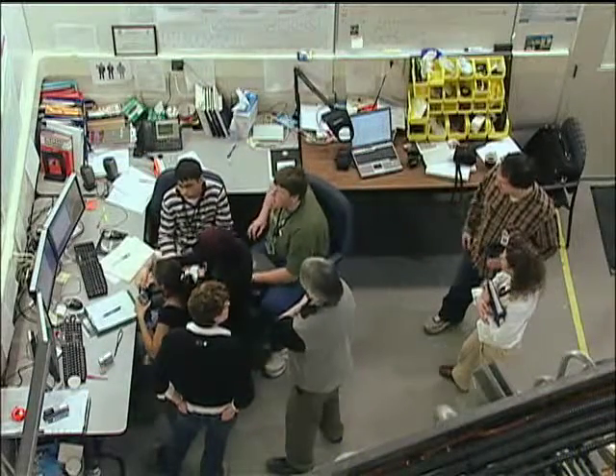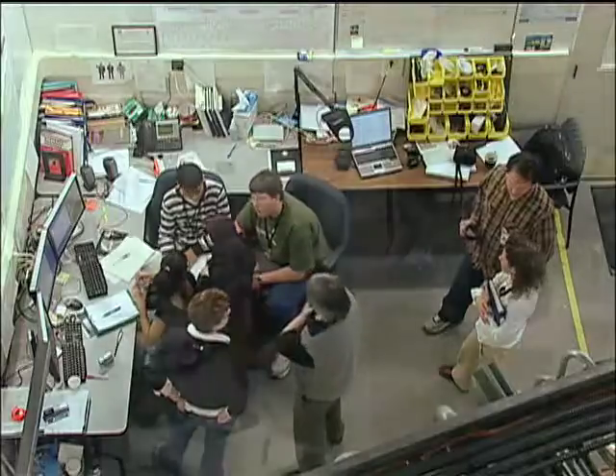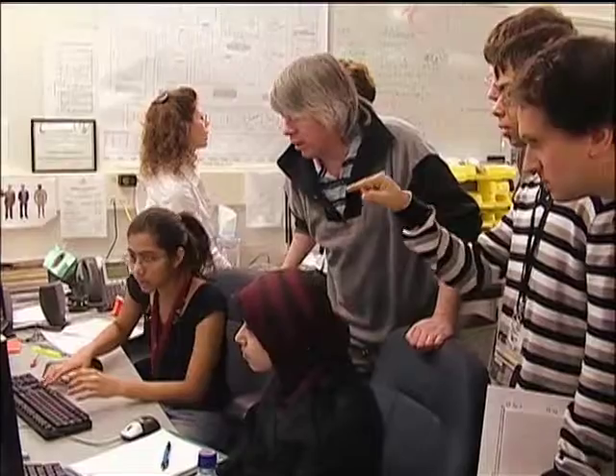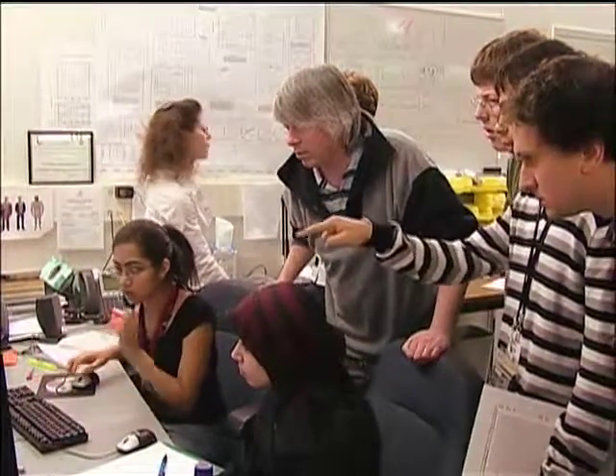During the course of the day, Dr. Robert Blythe has been gently guiding the students along. He says for a scientist, watching high school kids learn to use this kind of technology has been very exciting. Seeing the kids go from being very nervous at the start, not really sure, to being, frankly, a little too relaxed — that's really exciting. And to see them start to think, instead of asking 'is this right' or 'what does this mean', realizing they have to formulate it for themselves. They can throw ideas past me, but I don't know the answer. I think that is very, very good.